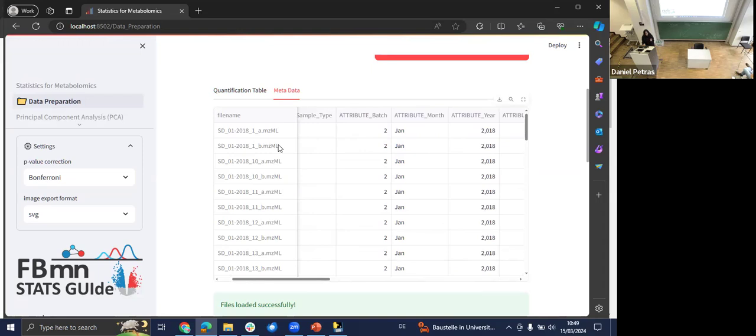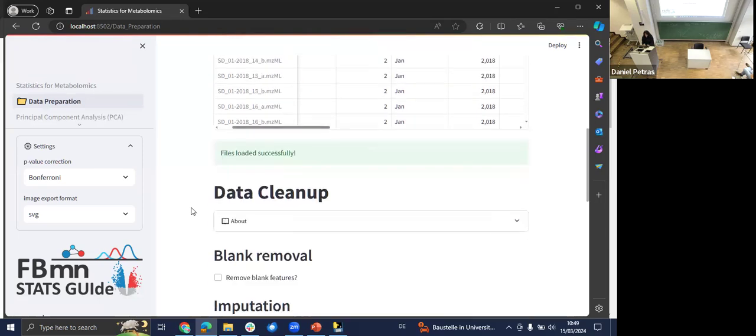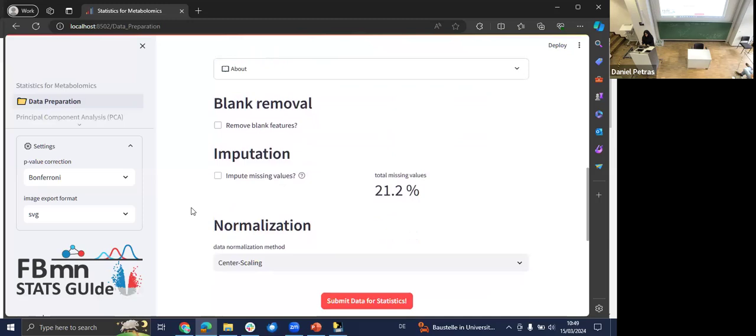So some little information when you're making metadata is to just not change anything with the file name. For example, whatever you got out of the MZmine feature table, copy that name and use it for your metadata creation, and do not change that. So once we have this, we can go for the data cleanup.